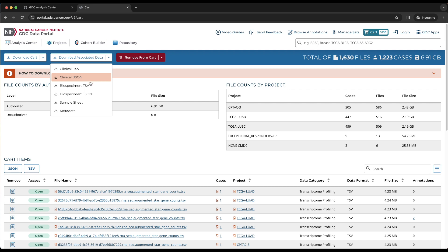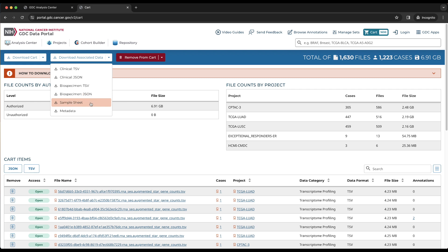Biospecimen data about the files can be downloaded in JSON or TSV format. The sample sheet, which is a TSV formatted file with commonly used information about each file and its related biospecimen entities, can be downloaded. Metadata downloads all information about the files in JSON format.